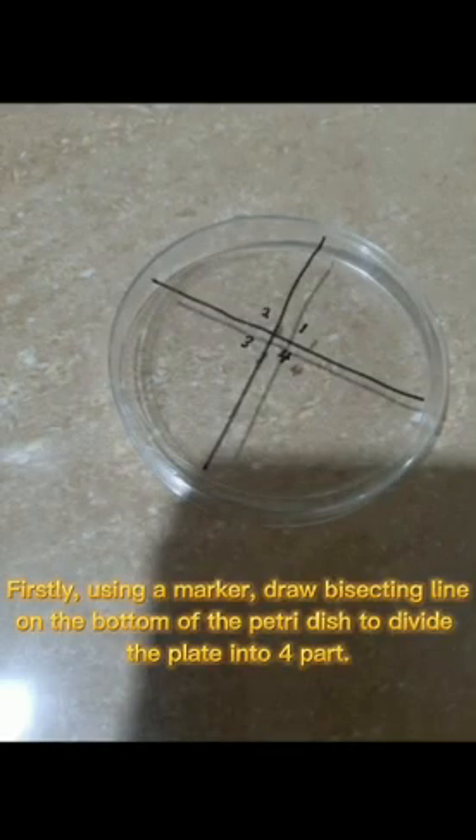Firstly, using a marker, draw bisecting lines on the bottom of the petri dish to divide the plate into four parts. Then label it.